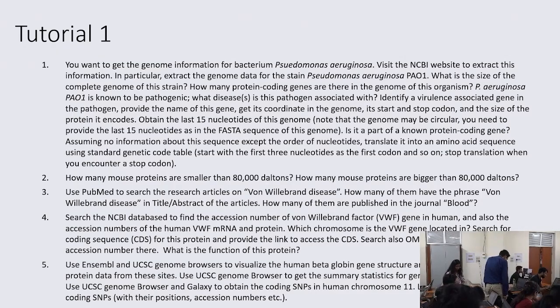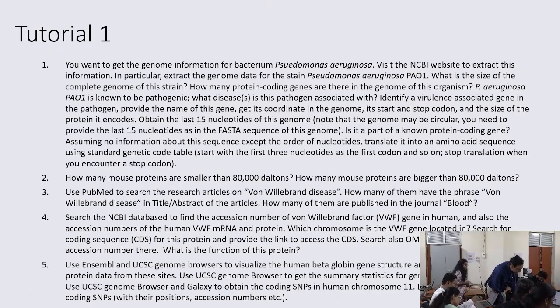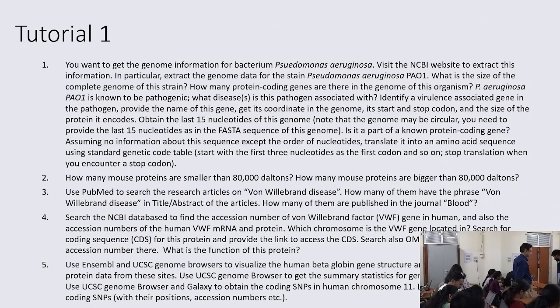There is some problem, oh, network issue. Oh, yeah, you got it. So, what is the size of the genome? You see, this is the exact 6,264,404, right? Yes. Good. If you put the cursor here, then you will get the exact size. So, note down that.